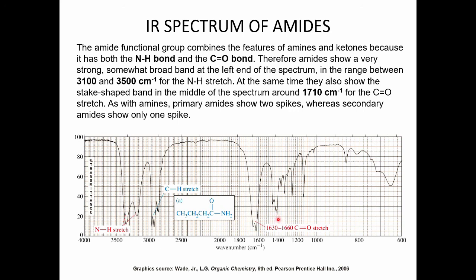And then second, when you're analyzing these spectrums, just please try to stay above the 1400 range. Looking down below is going to be fairly difficult just because of how many peaks show up that can mess up the signal.